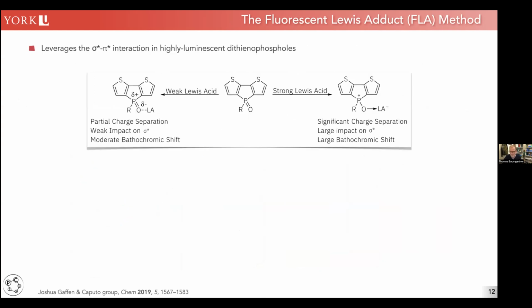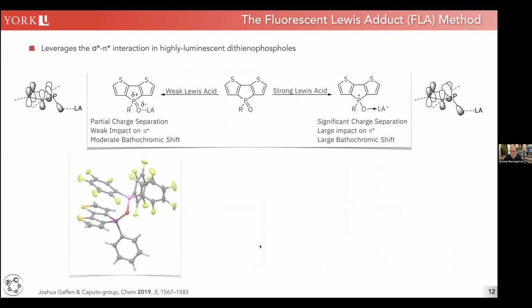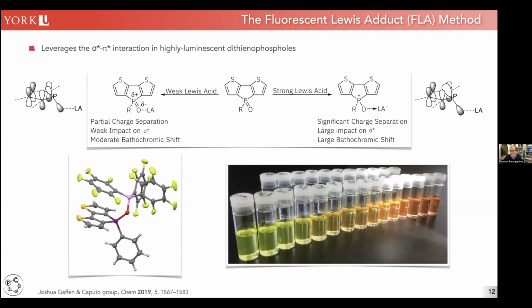Yeah. So basically, let me just quickly summarize this here. We need an excess of Lewis acid to make sure that in the Lewis acid binding, we only have one fluorescent species in there, or the 100% coordinated species, let's put it this way, in the solution. So we usually have an excess there. Eventually, the color won't change, and that's basically the color of the adduct that we're measuring. So those are the two things we need. We need no Lewis acid coordination, and we need something that's 100% Lewis acid coordination.